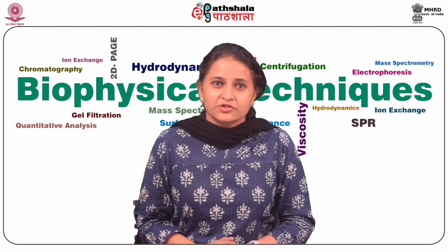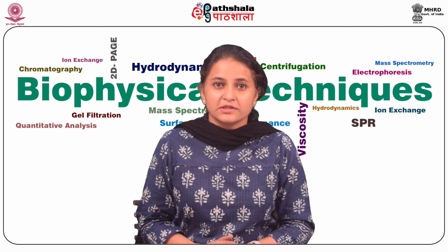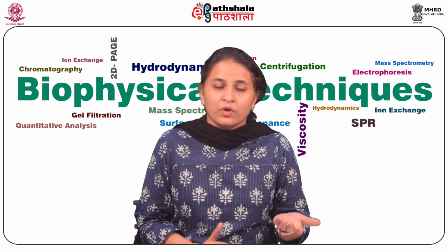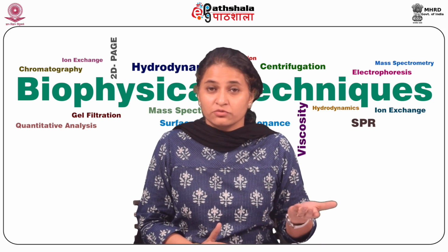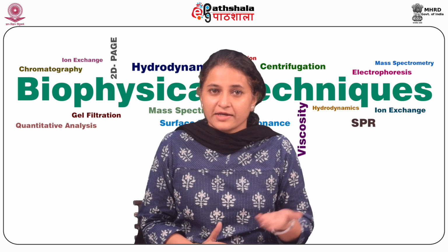As we have discussed during the practical aspects of GC method development, derivatization may be needed to convert a compound so that it is amenable to analysis by gas chromatography. One of the examples of derivatization which we do also in our labs is conversion of fatty acids to their respective methyl esters.